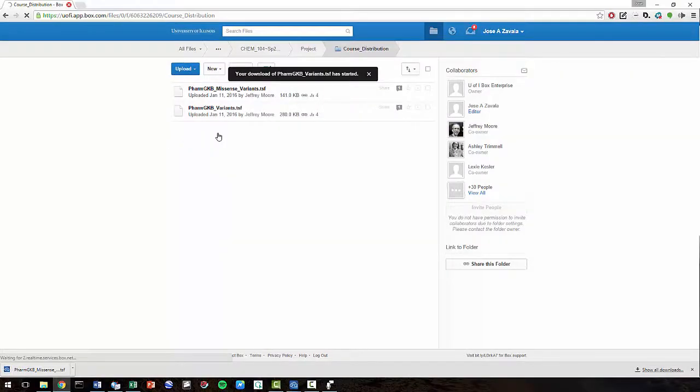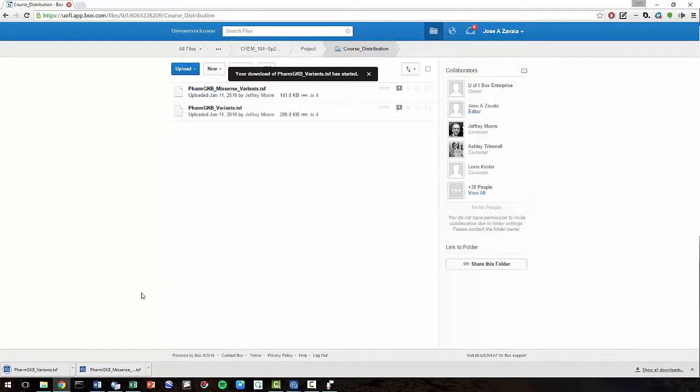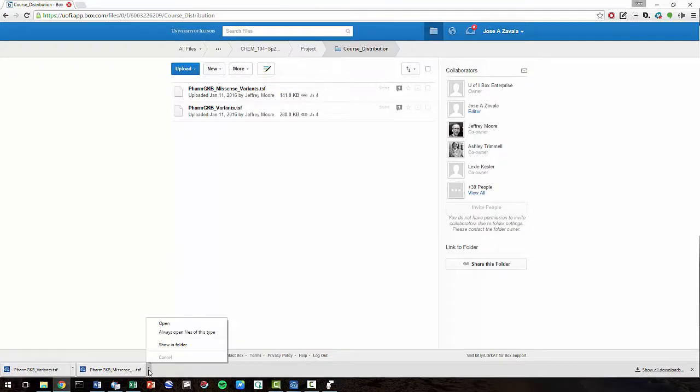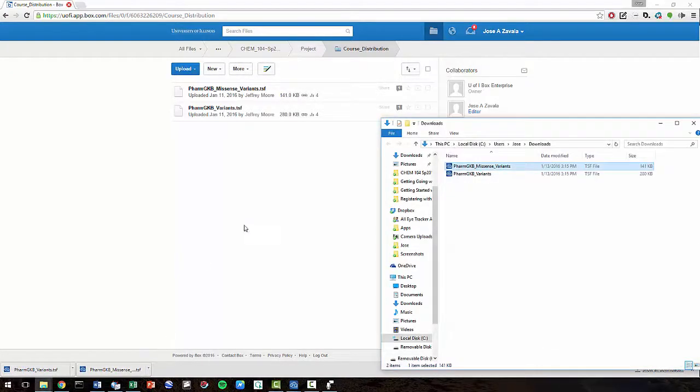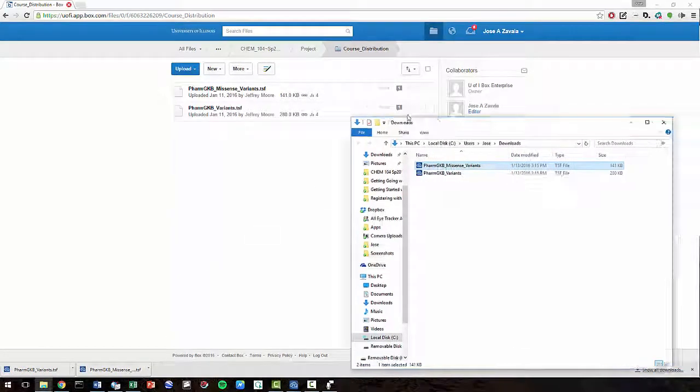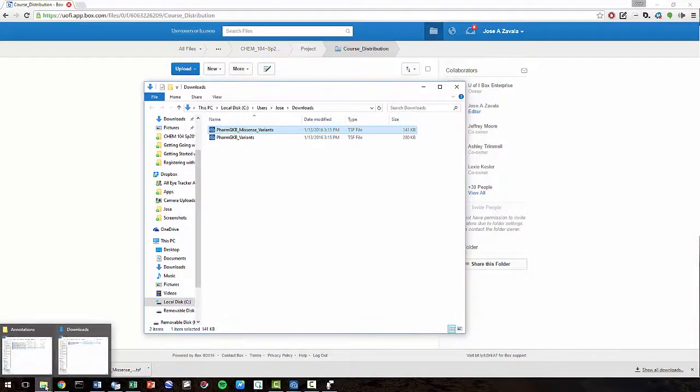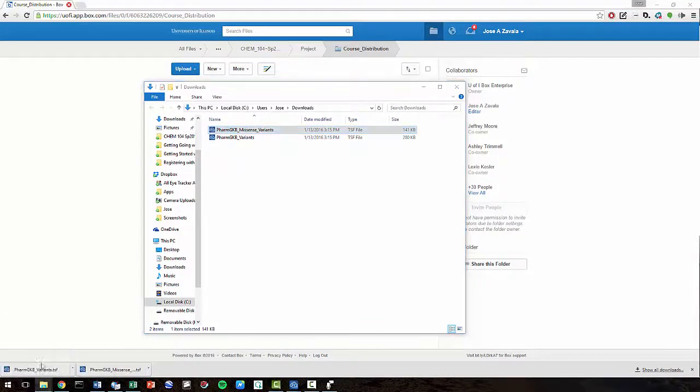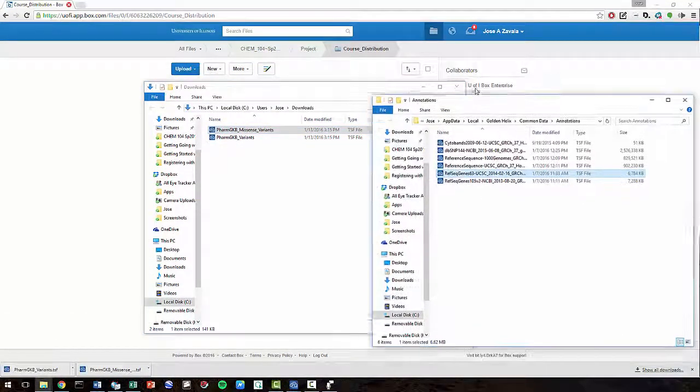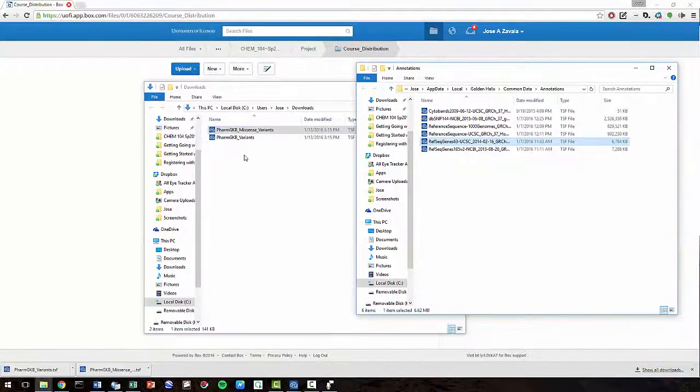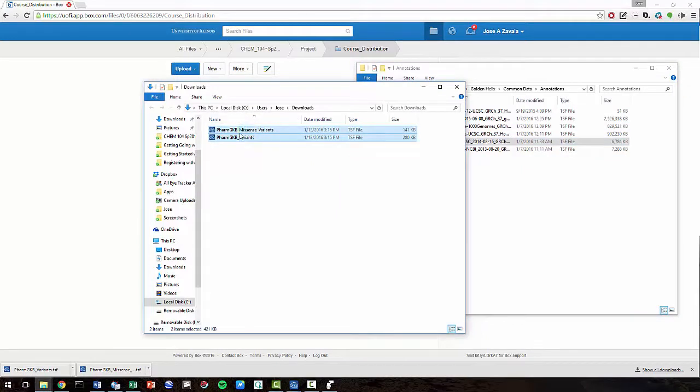Once the downloads are complete, click Show in Folder. Now let's also open up the Annotations folder and drag the two PharmGKB files into the Annotations folder.